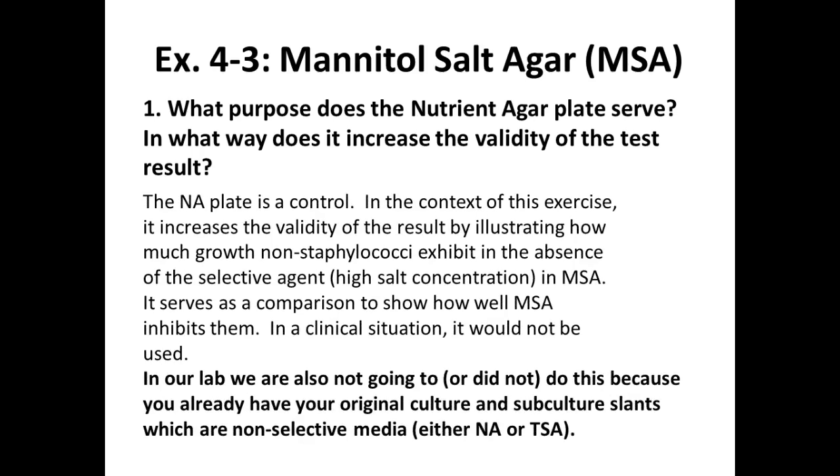We didn't do that because, again, you've already seen your organism growing under those conditions, right? Instead of using more plates. If you remember, from the beginning, most of your organisms were kind of clear looking or creamy. There was only a few of you guys that had pigmented colored organisms, right? So the colors that we'll see later are from this special media, not your organism's normal look. And also this would help us confirm that your organism could grow, that it is in fact the salt that killed it.